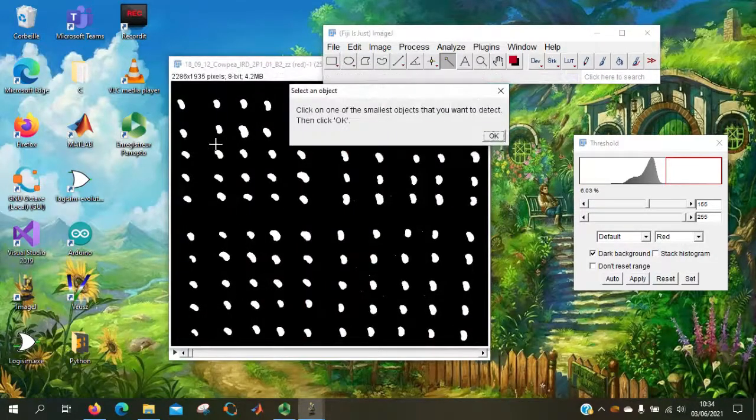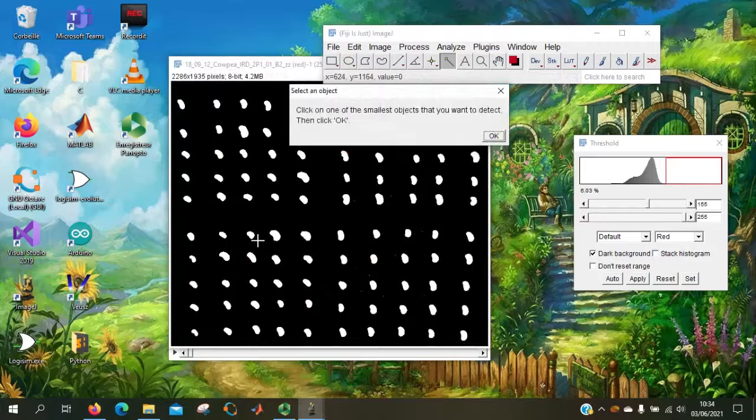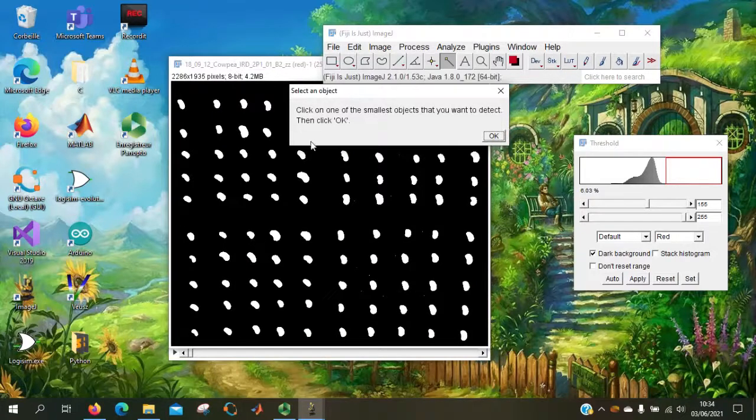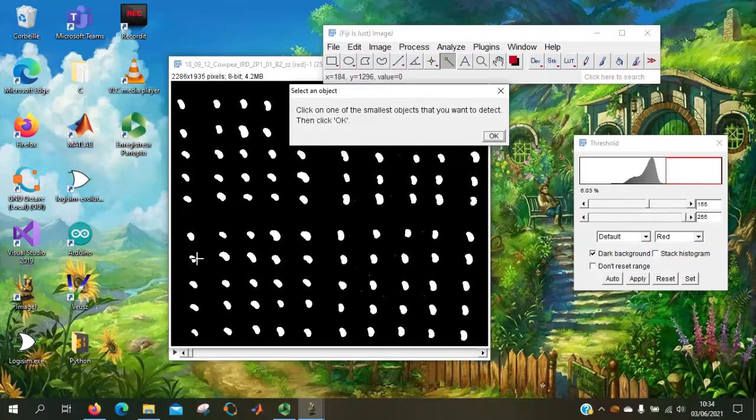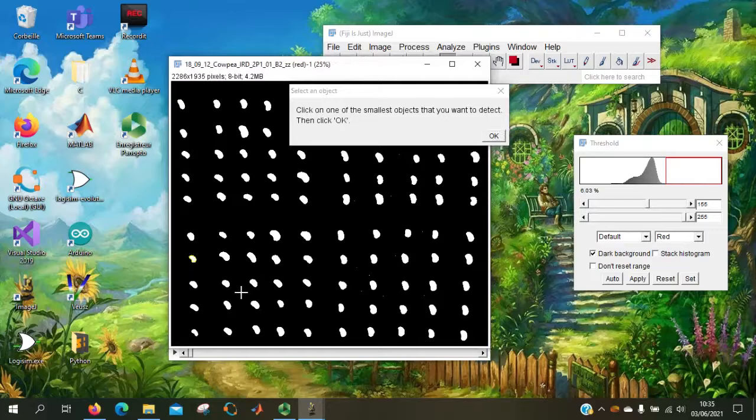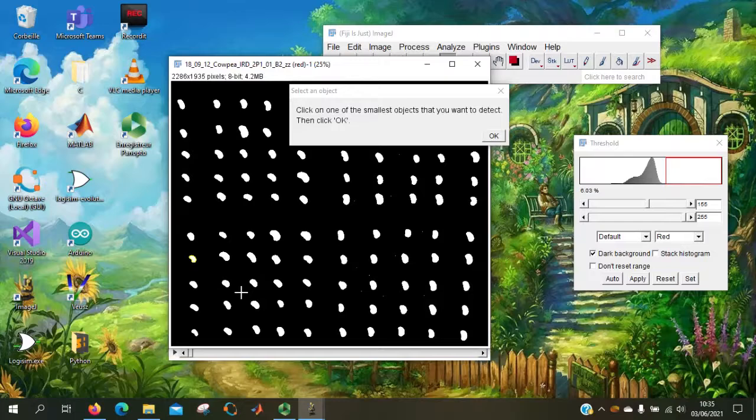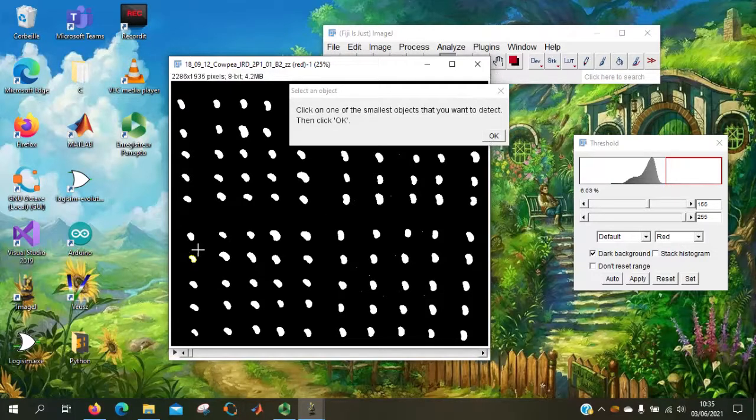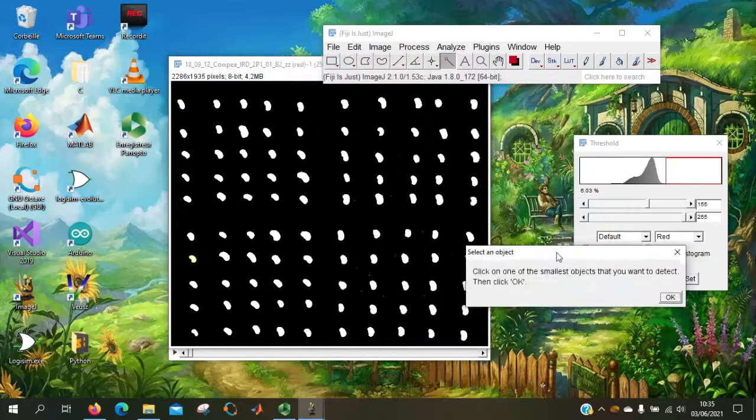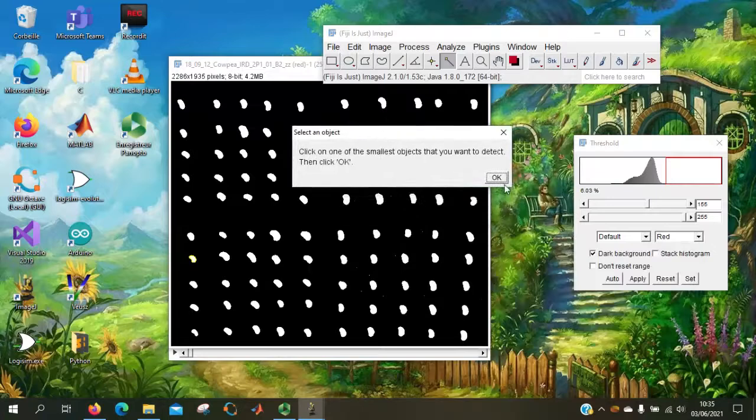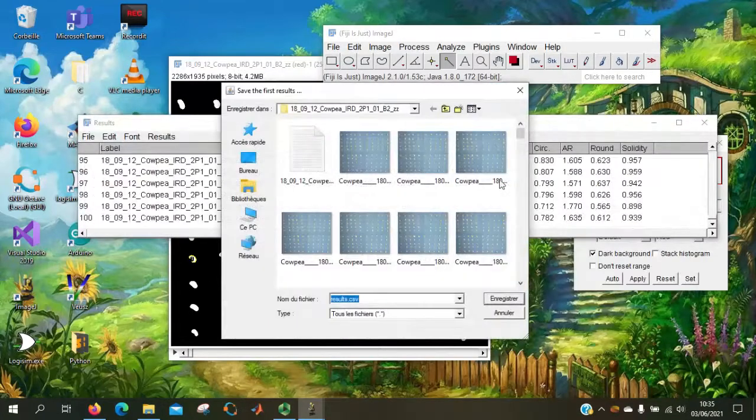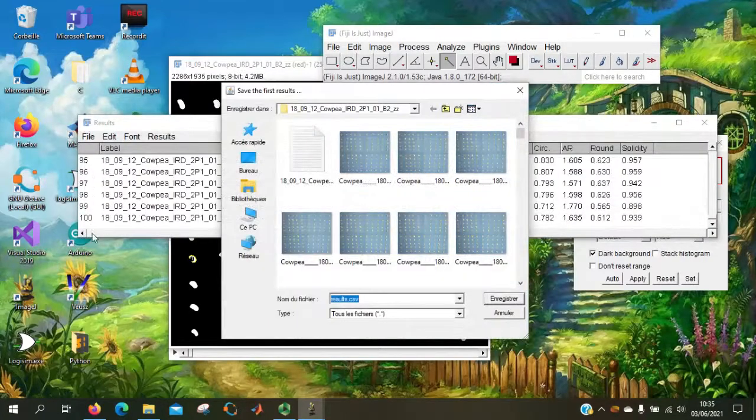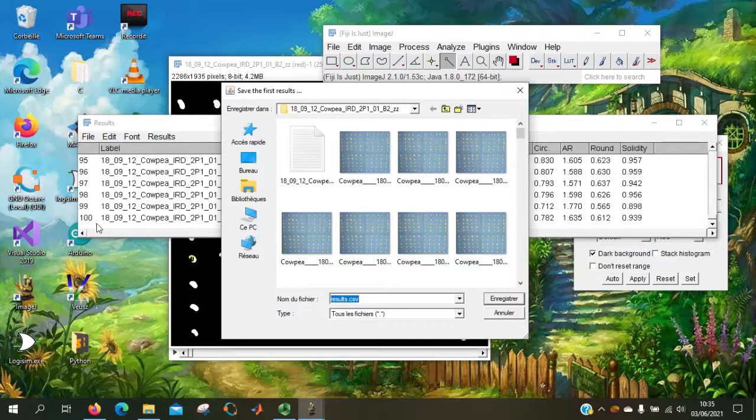This is the binary images. It asks the user to select one of the smallest objects on the image. It's to set a threshold for further detection. Here it is one of the smallest. It has detected 100 seeds.